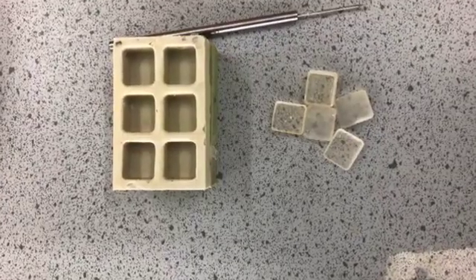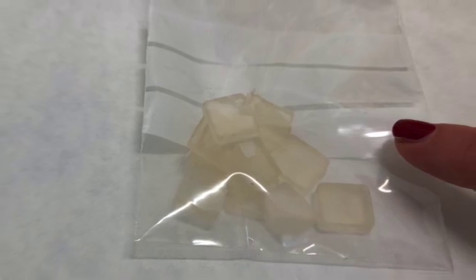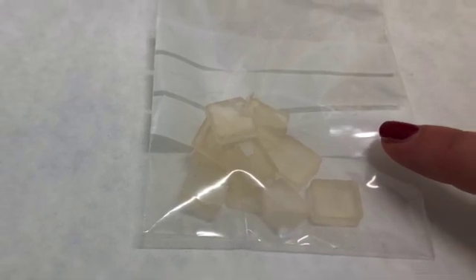Any extra adhesive that we've prepared earlier will be stored in a ziplock bag and we will use those later for further analysis.